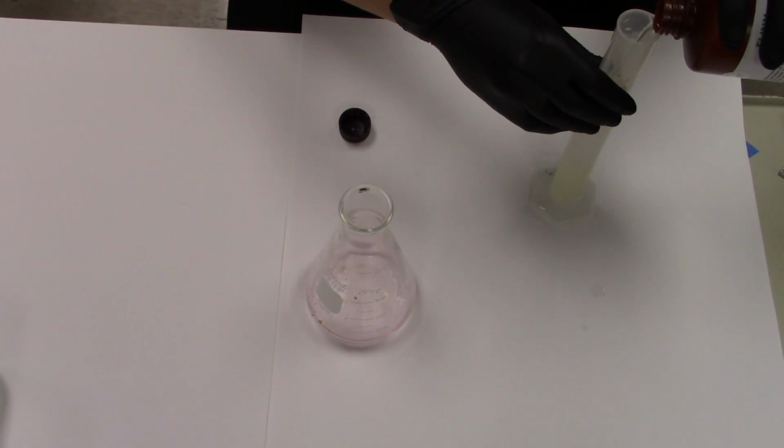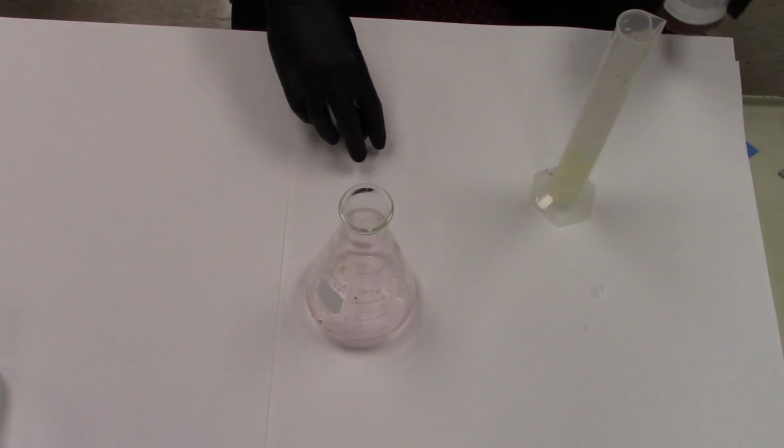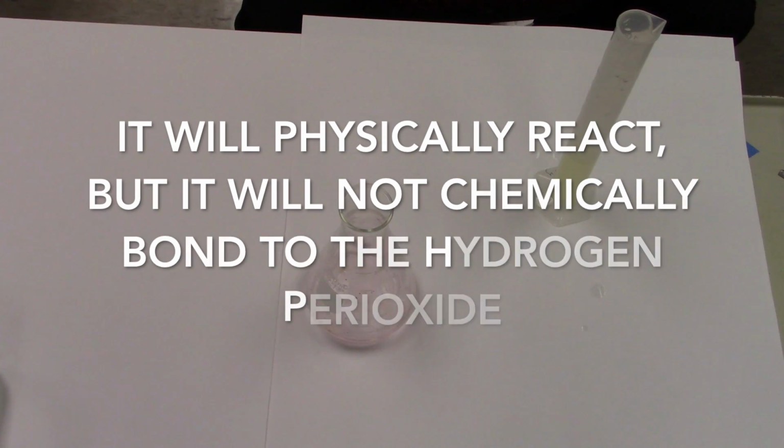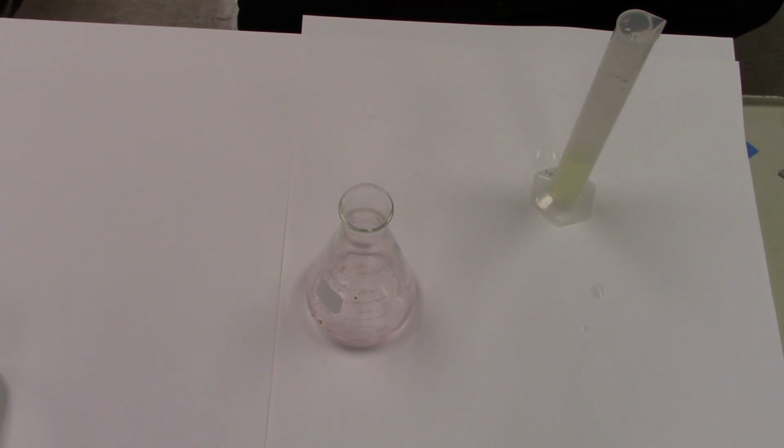This stuff is potassium iodide. Now, potassium iodide won't chemically bond with the hydrogen peroxide, but it'll speed up the reaction, right? It's called a catalyst.